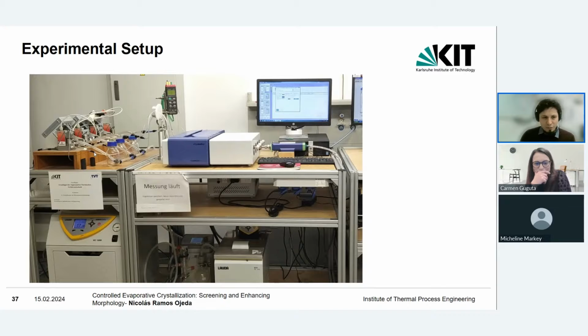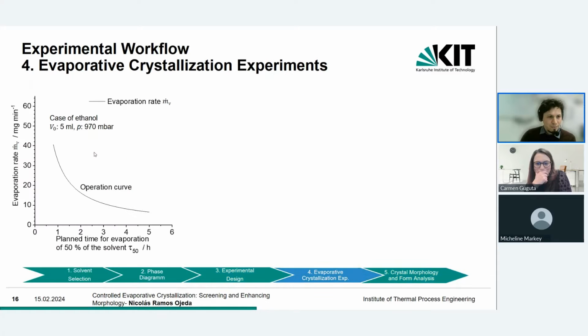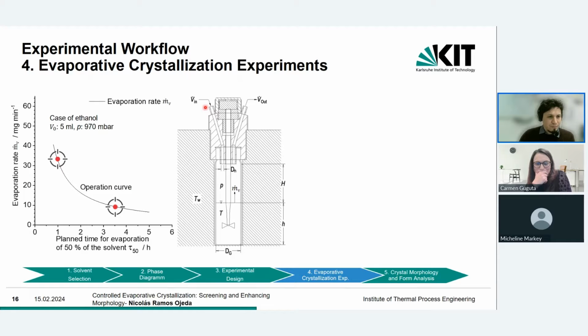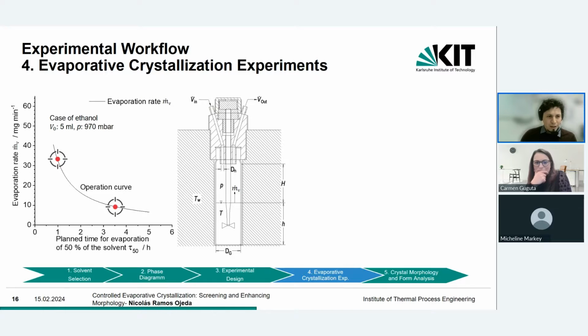And this vial, it will look like this. So you just need to ensure that the final hose has exactly a diameter that you can just put inside here, or actually just enveloping the nozzle in the crystalline lid.